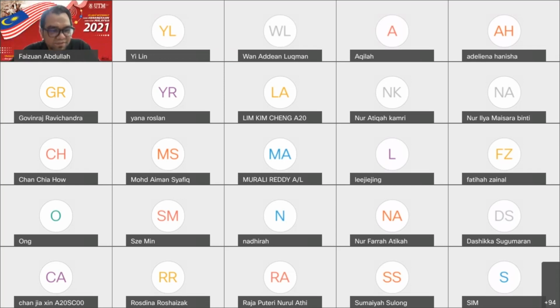Why? This is also tricky for you, but I need to teach you. I need to tell you this thing. And I would like to ask your idea first. Why can you not prepare 0.1 ppm of zinc solution directly from 1000 ppm? Why?